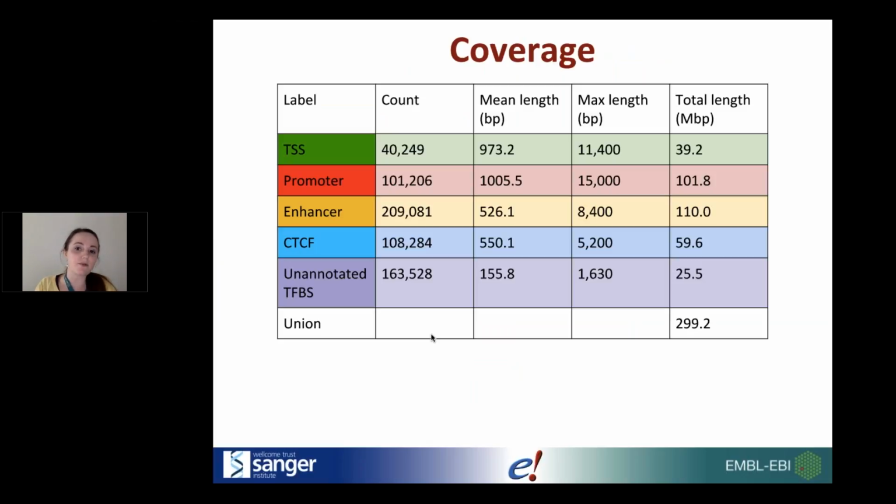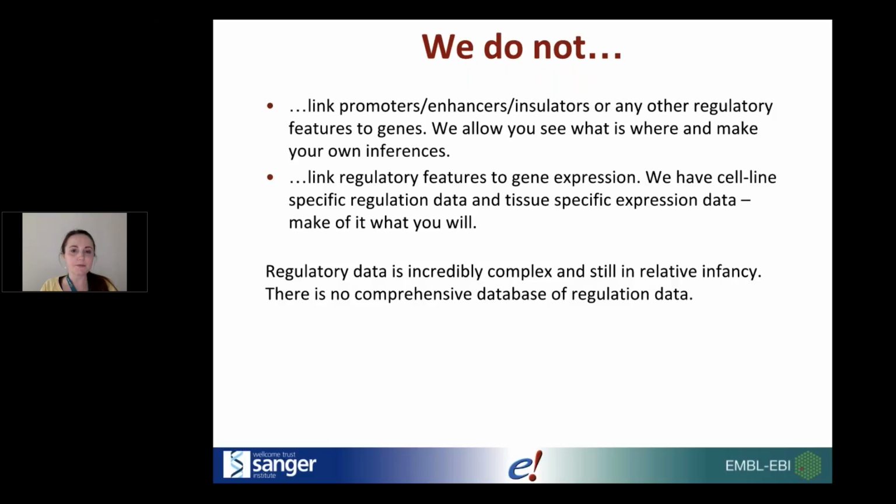Through this analysis, we've covered about 300 megabases of the genome, identified as carrying out these different kinds of functions. So about 10% of the human genome we've identified as being involved in regulatory activity. Just to point out a couple of things, a couple of provisos.